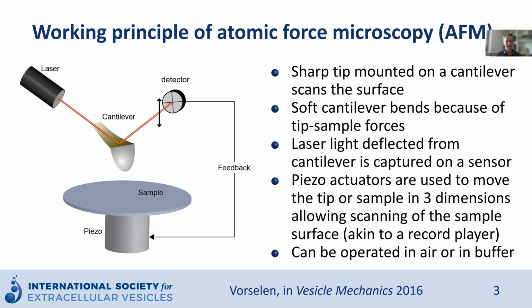Importantly, AFM can be used both in air as well as in liquid environments. When working with EVs, I would strongly recommend operation in liquid because this more closely reflects the physiological environment of the EV, and working in air can substantially affect your measurements.